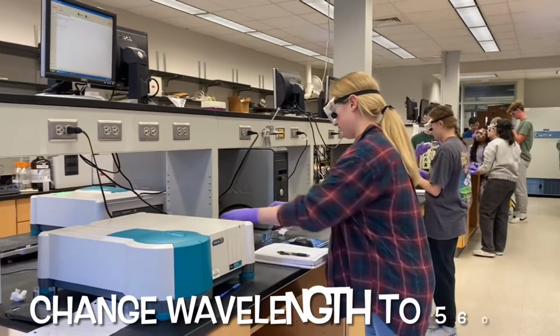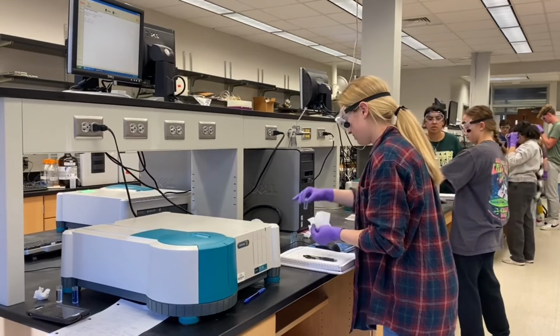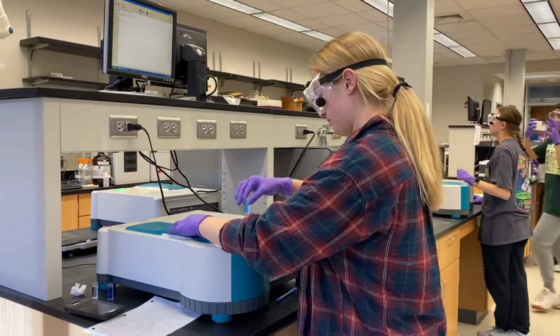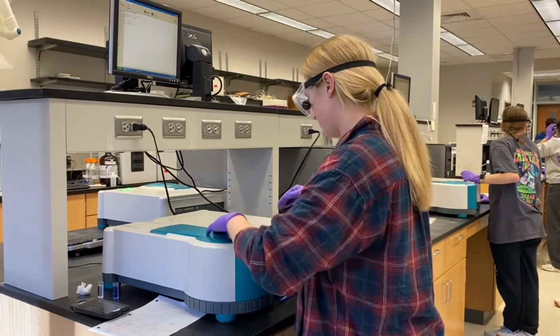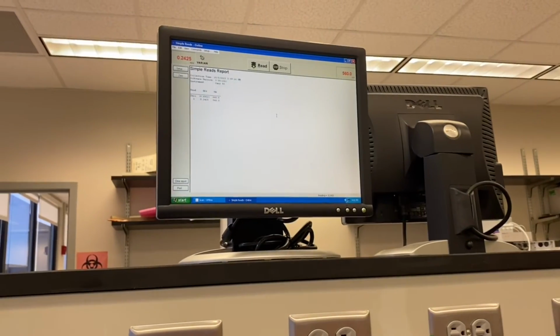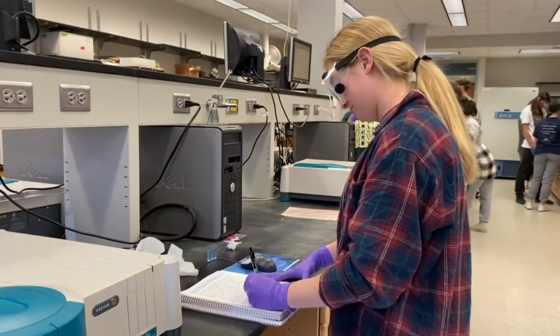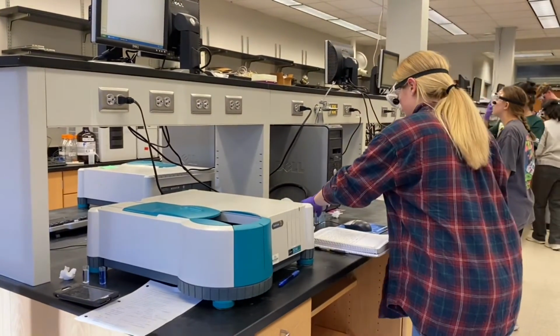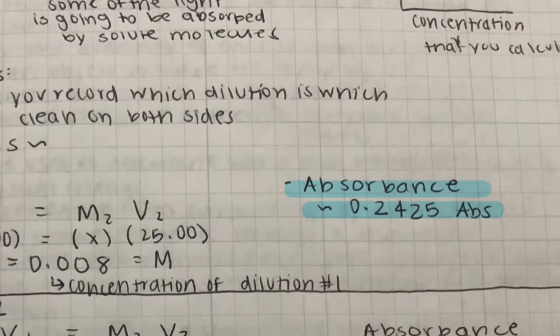Once you have zeroed the spectrophotometer, you are ready to get the absorbance of your sample. Grab your cuvette and wipe the two sides of the cuvette. Open the spectrophotometer and place the cuvette in the machine with the clean sides in the beam, and close the machine before scanning. Hit start to record the absorbance value. Record this value in your notebook, and then once you are done, carefully remove the sample from the spectrophotometer, and then close the door. Absorbance value is 0.2425.